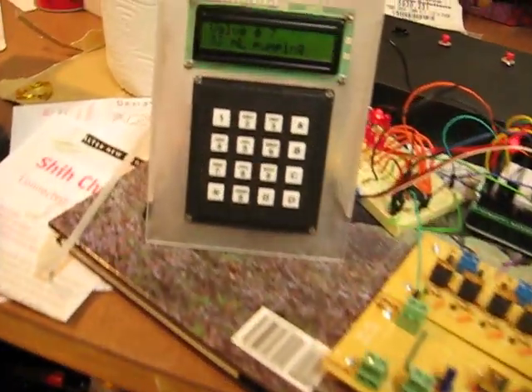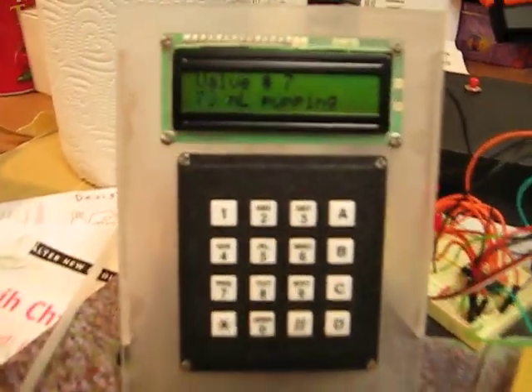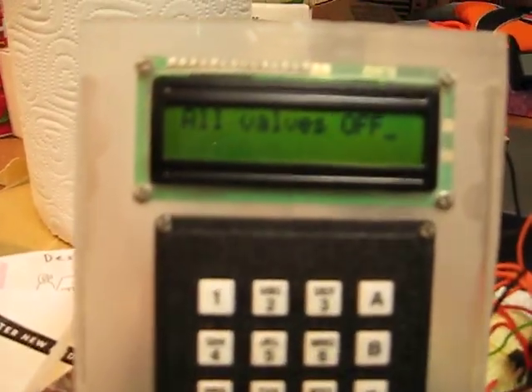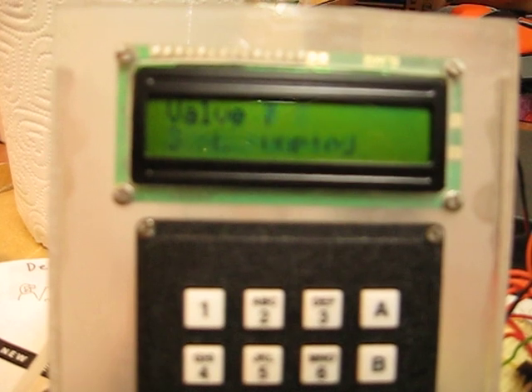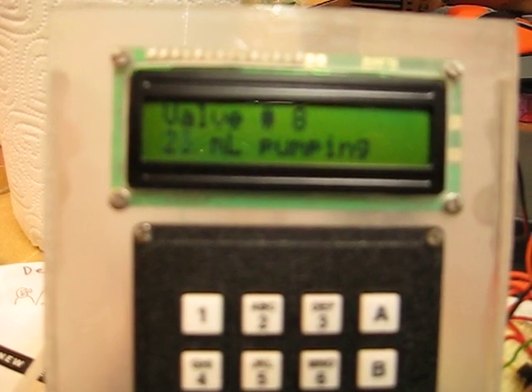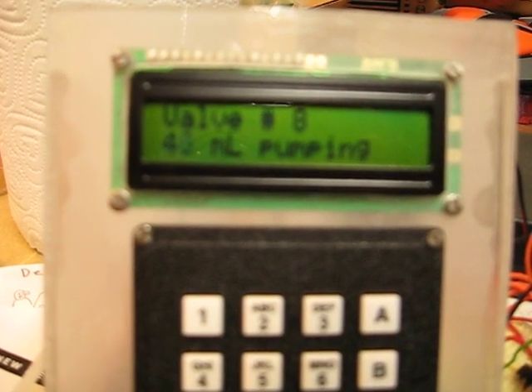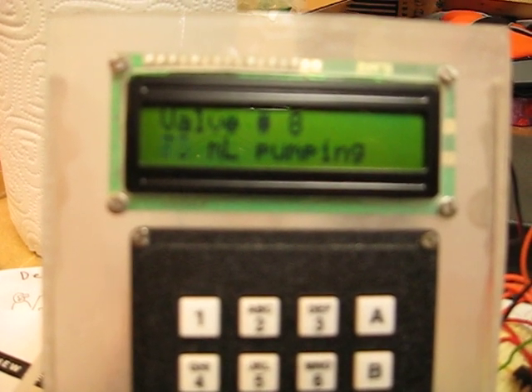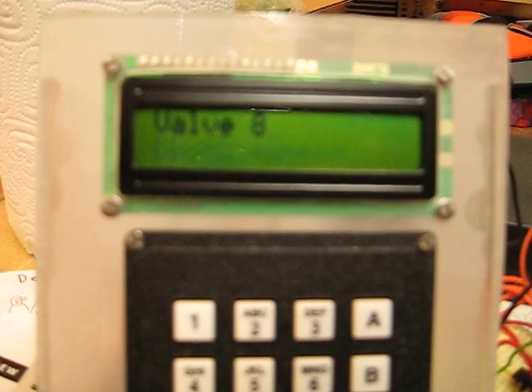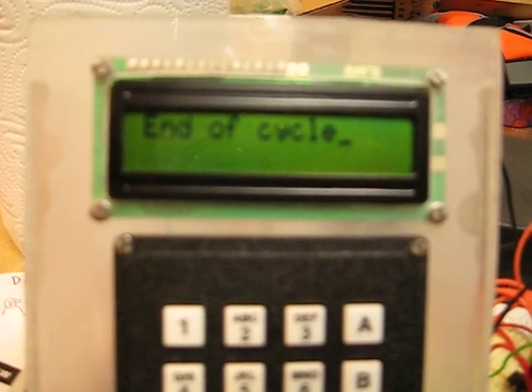When you get to the end of eight valves, the last valve is valve number eight, the cycle is complete. It says end of cycle.